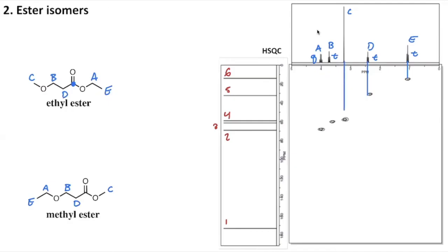I'm trying to use the help of my iPad software a little bit to make these lines as straight as possible. Some of them I may need to edit a little bit, so I'm going to pick them up and try to move them over carefully. If I can pick it up. There we go. Okay, move them over a little bit.